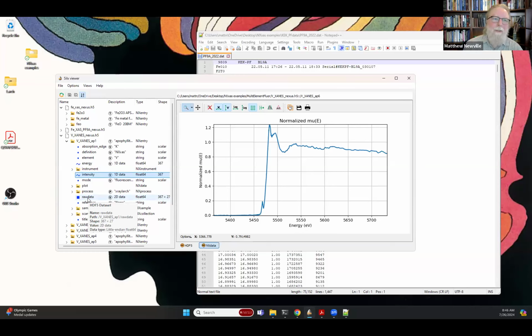On the other hand, if you prefer to take that raw data, all data is not quite raw, right? So if you want to take what you're calling your raw data or as-collected data, then you can process that already ahead of time. So I think that's kind of up to the beamline. And that would be similar. There'd be a similar response for dispersive XAFS, right? If you're measuring dispersive XAFS or full field or with a Frahm monochromator, how you turn that into energy and mu is kind of up to the beamline.